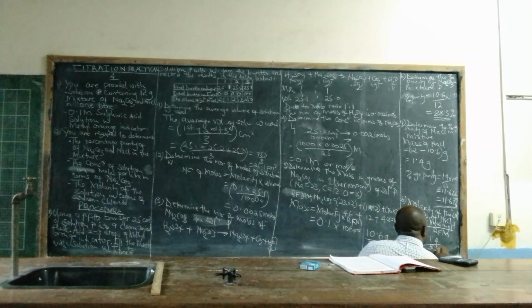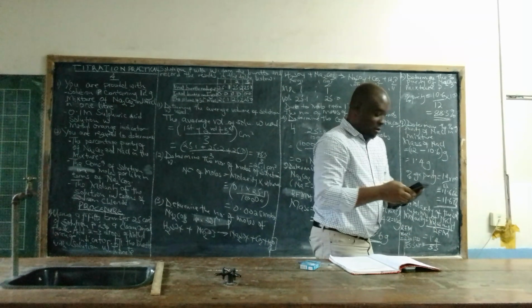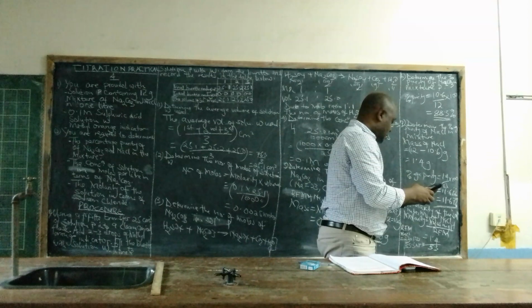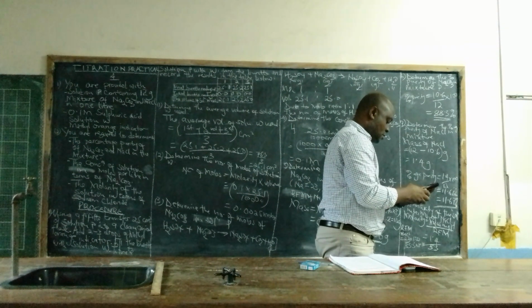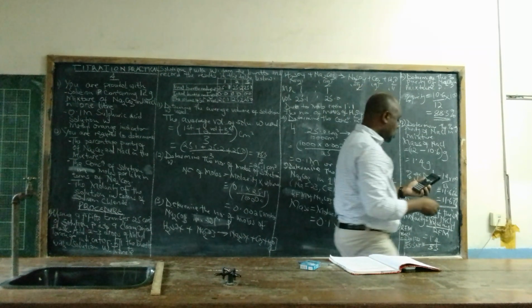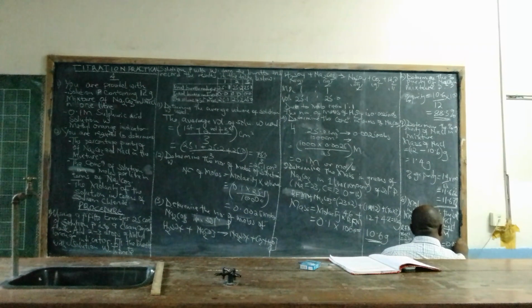If you divide very properly, you are going to get 0.02 M.